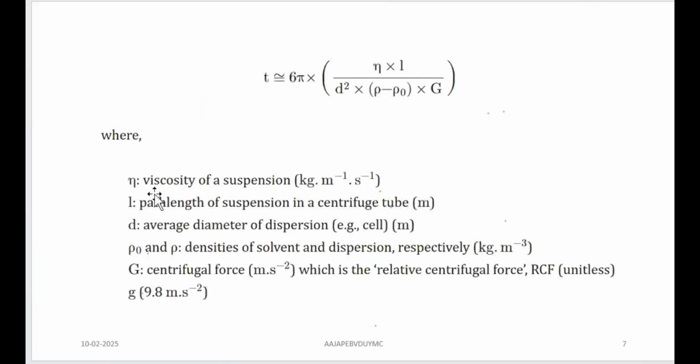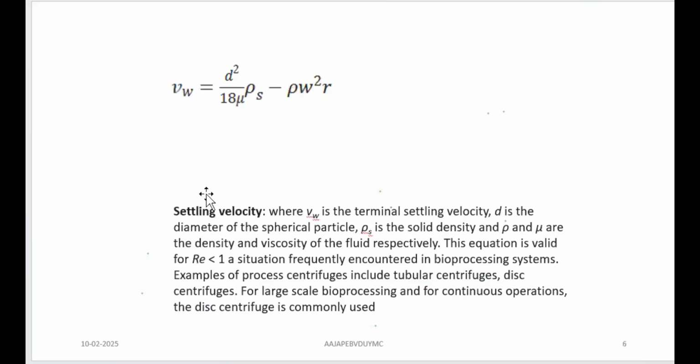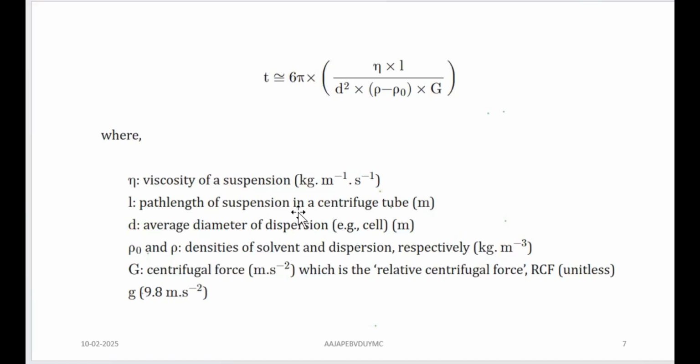Here is another thing, the time required that you can calculate, right? What are the things you can calculate? The speed, RPM. What you can calculate? RCF. What more can you calculate? G value. What more you can calculate? F value. What more you can calculate? Terminal velocity of sedimenting particle. And ultimately what you need is how long to run the centrifuge. The T is to be calculated, right?